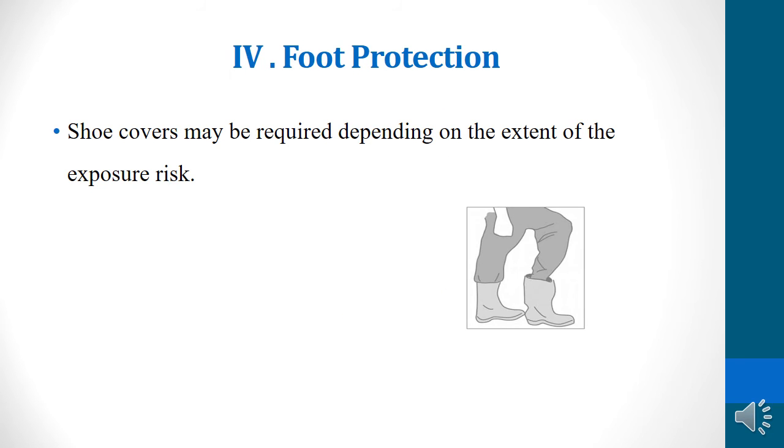The last type of PPE protection is foot protection. A shoe cover may be required depending on the exposure risk. And we are using this one in the operating room in our hospital.